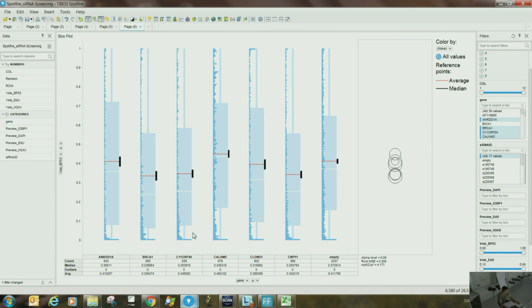So there is no point in showing t-test, p-value, which normally people do. So that's right from the average and the median, right? Yes, exactly. Because they're not overlapping. So basically in this case, I would say yes, kind of similar, because average and medians are overlapping almost. That's fine. But I think, see, this is the best.